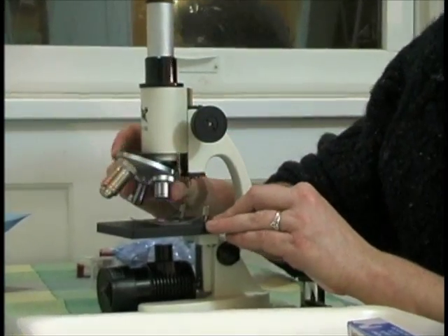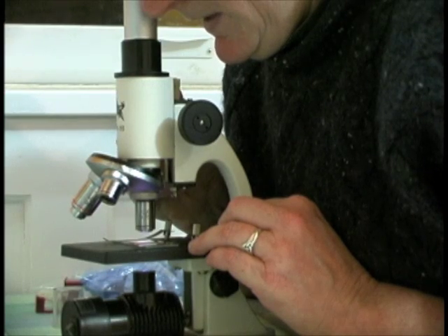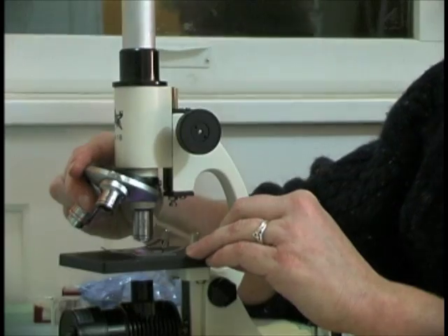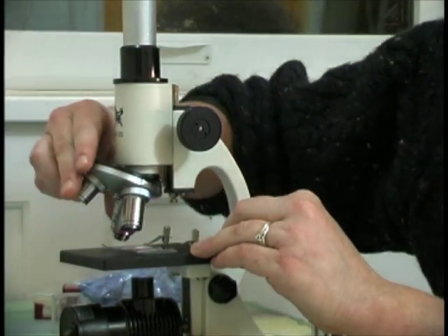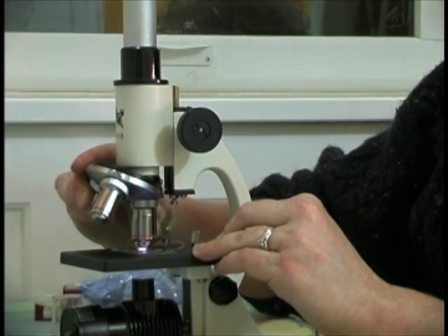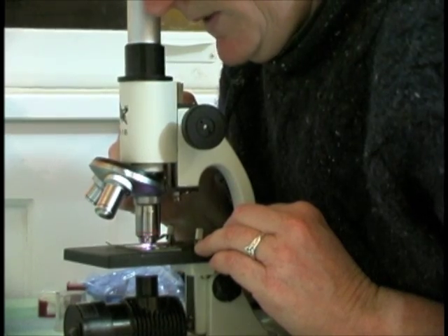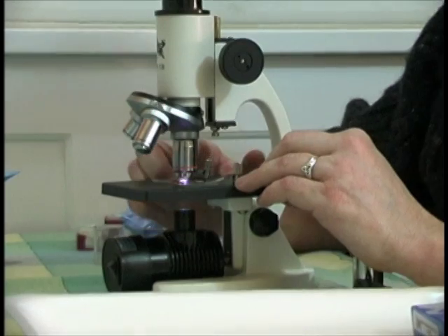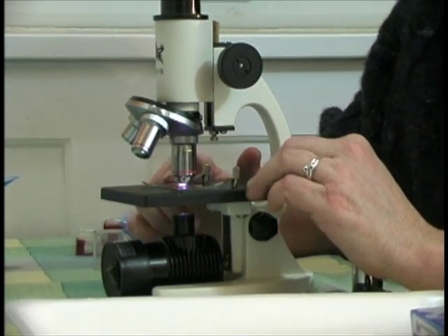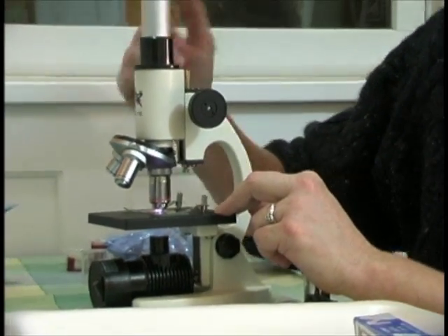Then I want to move to a higher power. I can see the cells at this point but I don't see the nucleus clearly, so I want to go to the highest power. When you move to the highest power objective, do it very carefully so that the slide does not run into the objective — you can break the lens and the slide. Here's where you want to really check out your cells and draw the phases of mitosis. Remember, the magnification is the eyepiece times the objective.